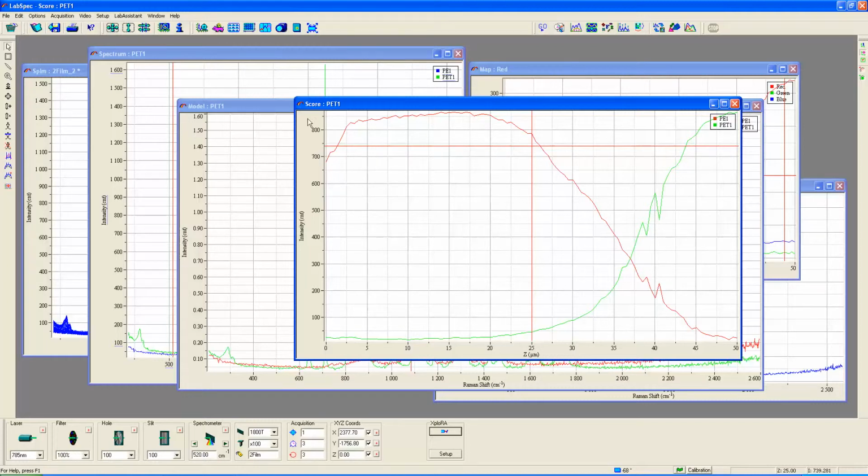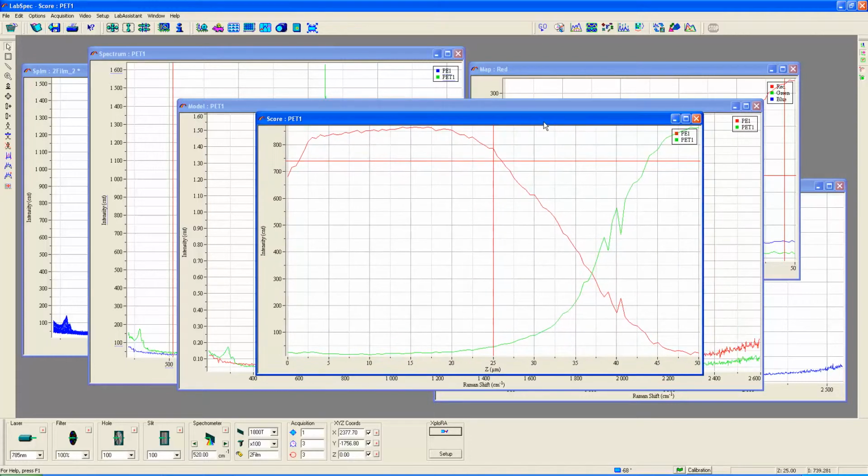But if you essentially wanted to get a general map or profiling that was approximately close to the true depths, and you wanted to identify films that were buried or underneath, then with a limited degree of accuracy, the stage motion itself can work quite well.